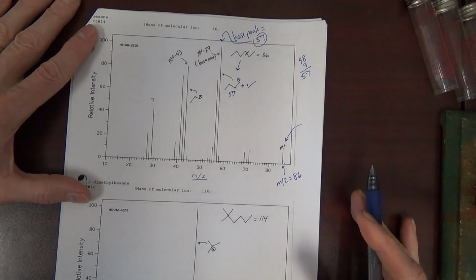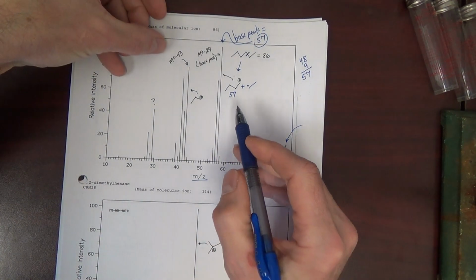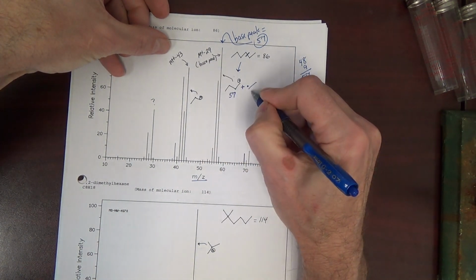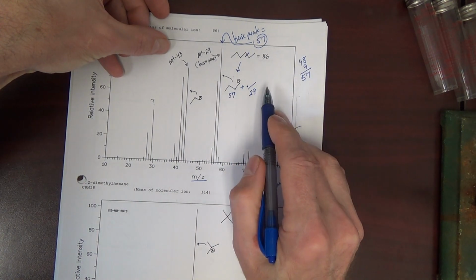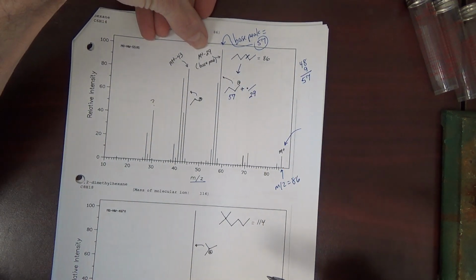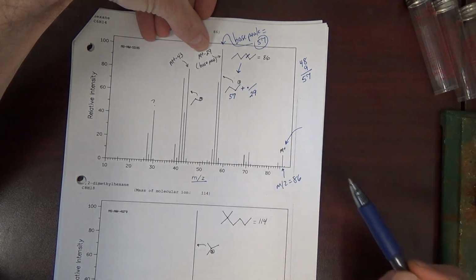But you could also cleave other places. By the way, this is 29. It has to be 29 because these have to add up to the original 86. We could have also called this peak M minus 29, because we lost an ethyl. Ethyl is 29.